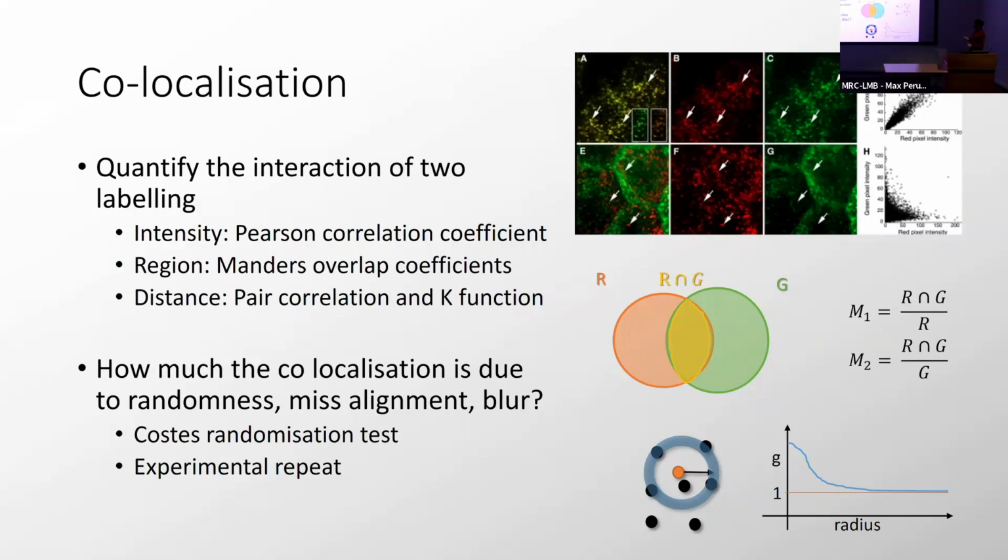You could have a correlation approach, an intensity-based one. Are my two signals correlated? Are they on the line like here? Then we will have high correlation. Or are they not correlated? Here we have red intensity and green intensity. We see here they are correlated, but here they are not, so they're not on this line.